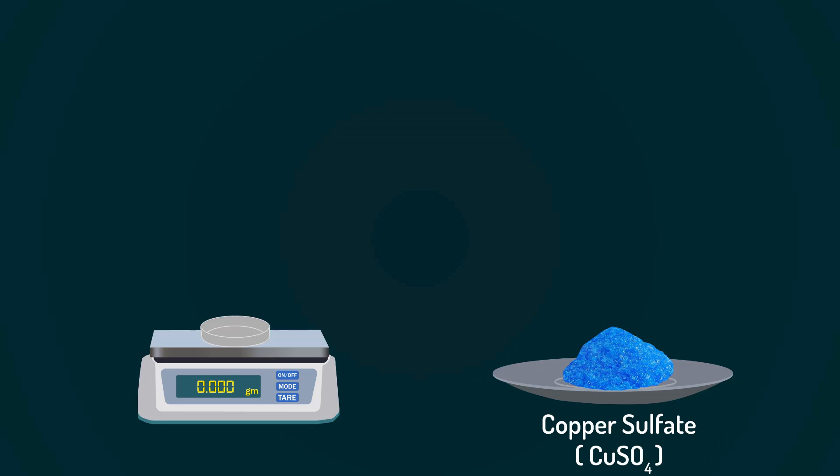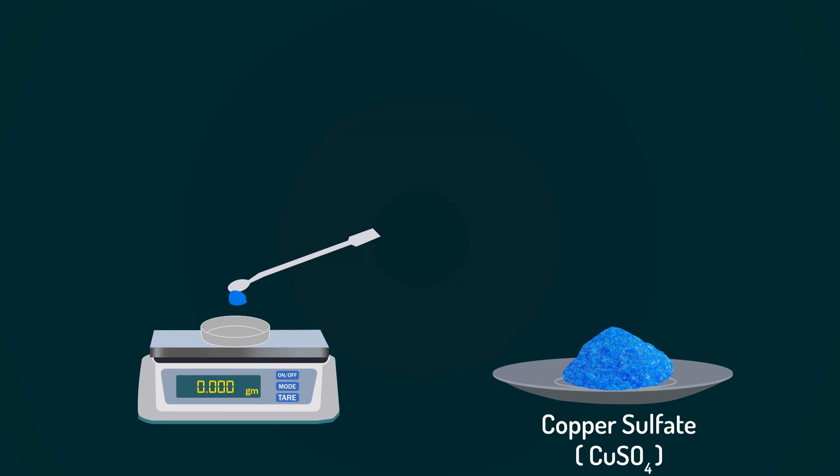Now, add copper sulfate into the petri dish with the help of a spatula. Weigh precisely up to 1.38 grams.